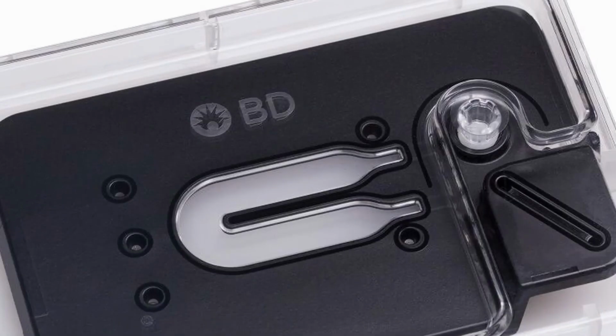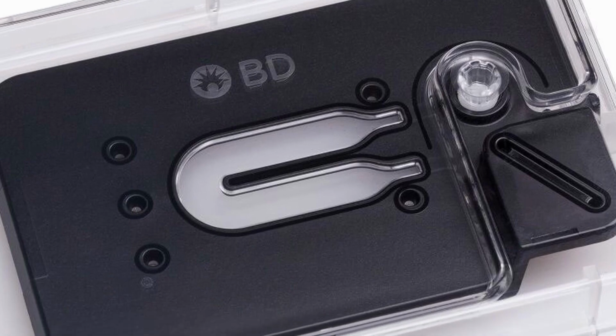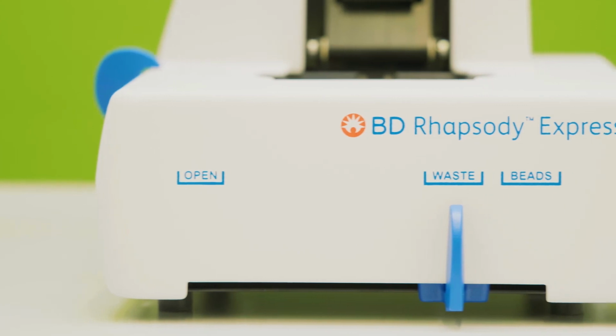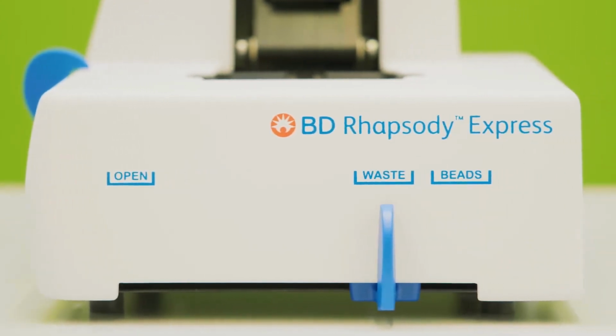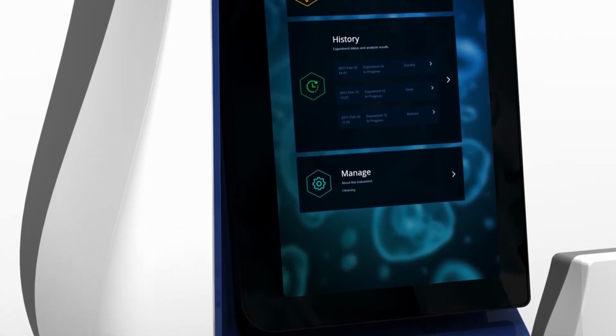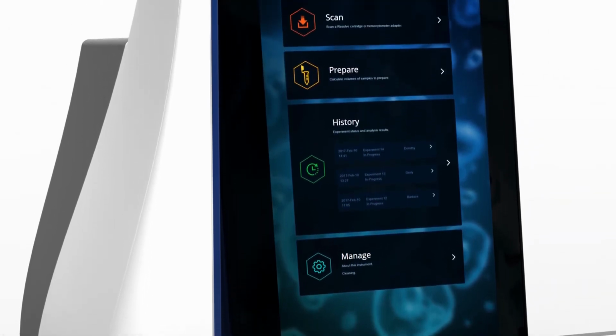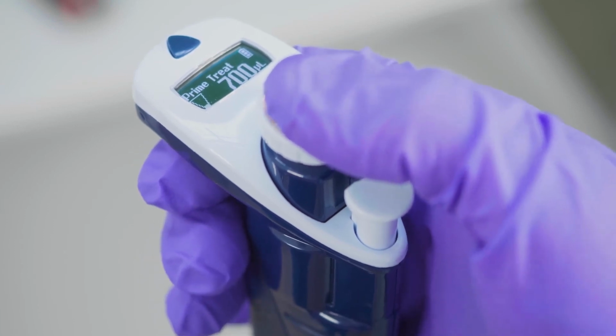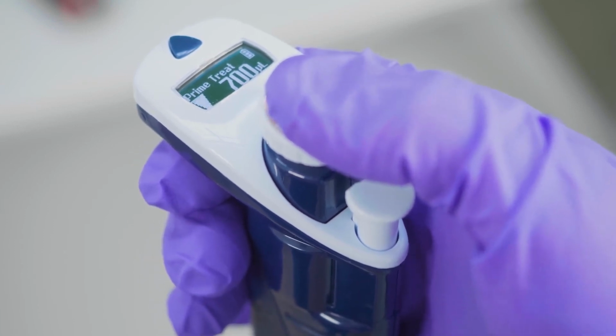The cartridge is a consumable and the core of the BD Rhapsody system. The BD Rhapsody Express Station is a device to hold and manipulate the cartridge throughout the experiment, while the BD Rhapsody Scanner is used to monitor the experiment through the acquisition of live images. Two electronic pipettes come with the system that are pre-configured for the individual steps of the assay.